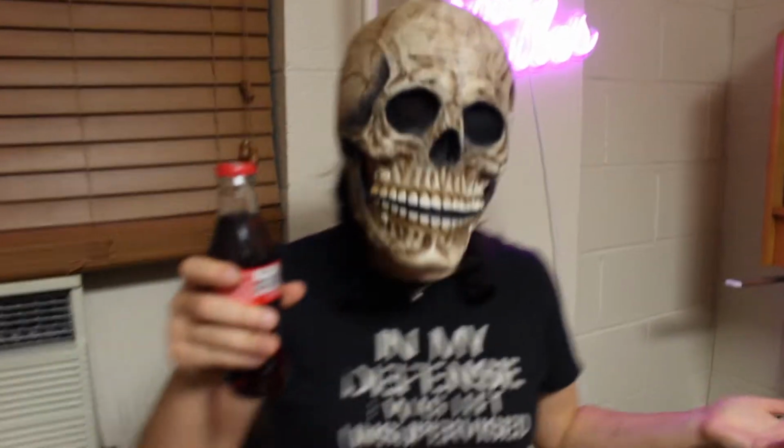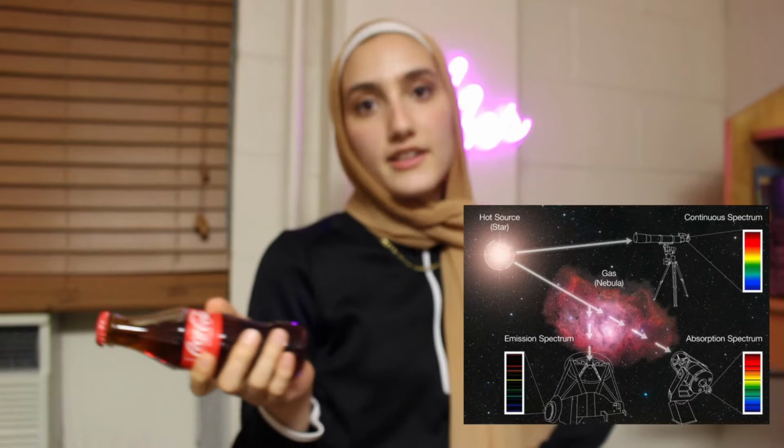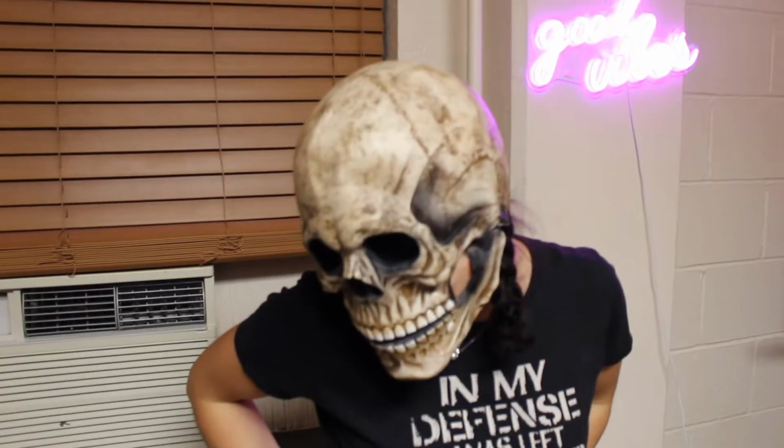Okay, cool, but what do you use this for, really? Well, you could use the spectroscope for the study of stars and objects in space, usually by astronomers. And also, you can use the spectroscope for knowing the molecular structures, as I said, of different samples and experiments by scientists. That's what I think, honestly.